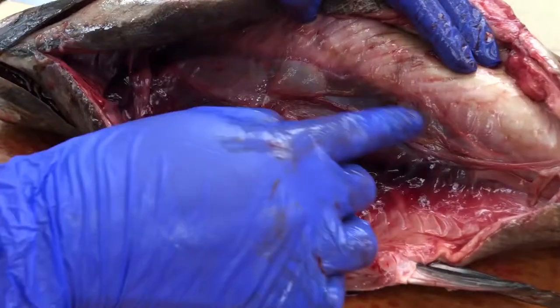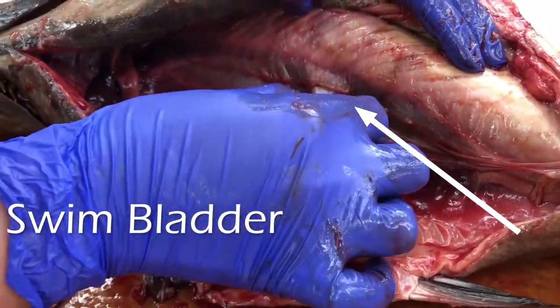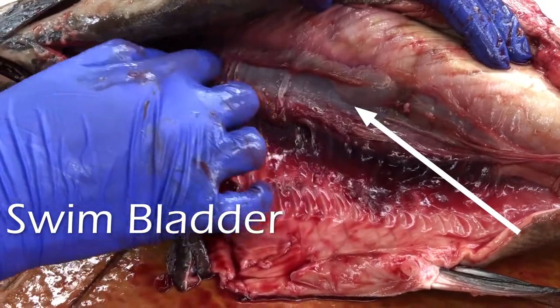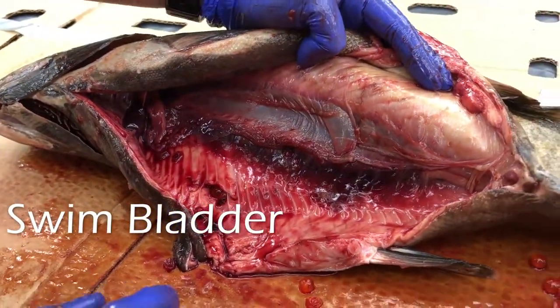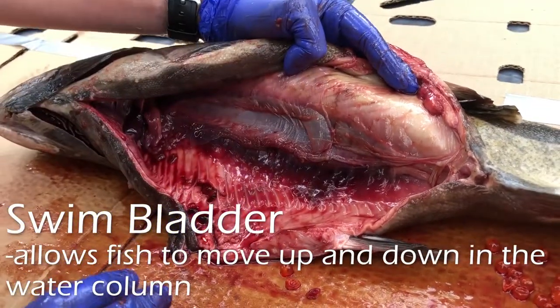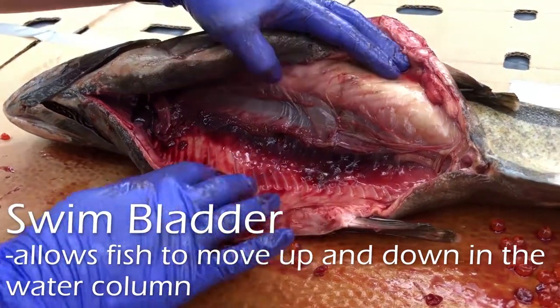Back here we have the swim bladder. You can see it's like a balloon — it's still got some air in it. The swim bladder is used for fish to go up and down in the water column. They will inflate it with air when they want to go up and then let some air out of it when they want to go down.